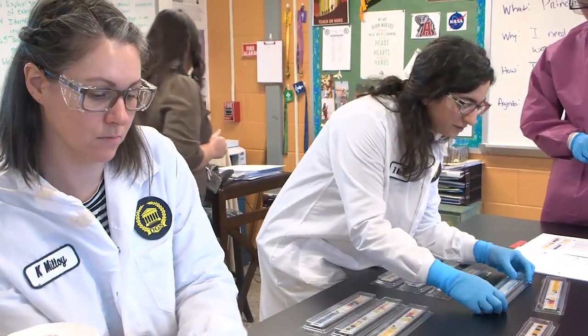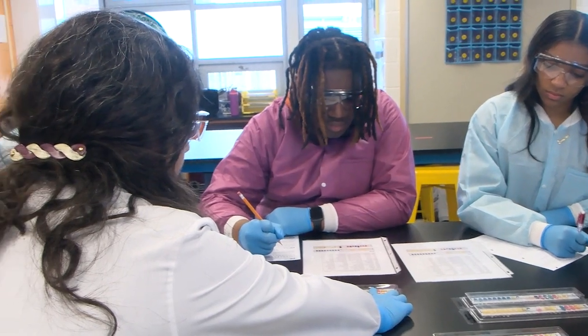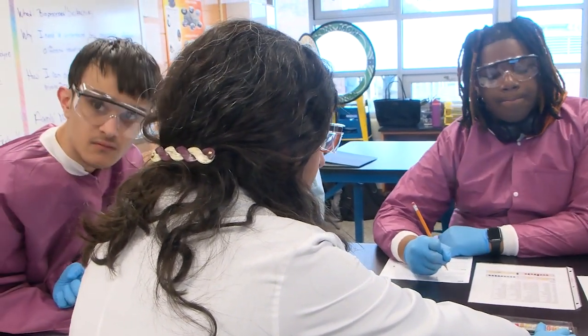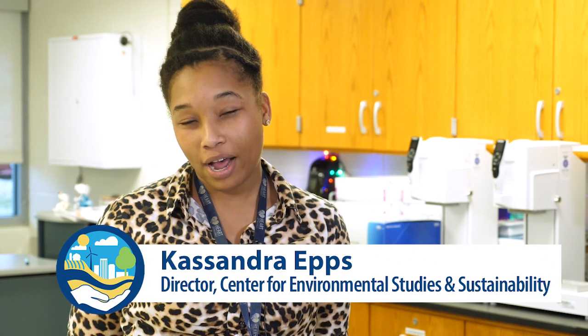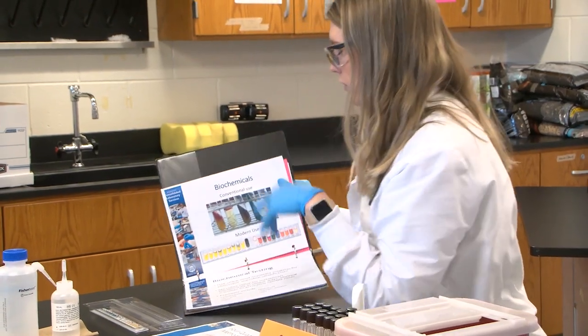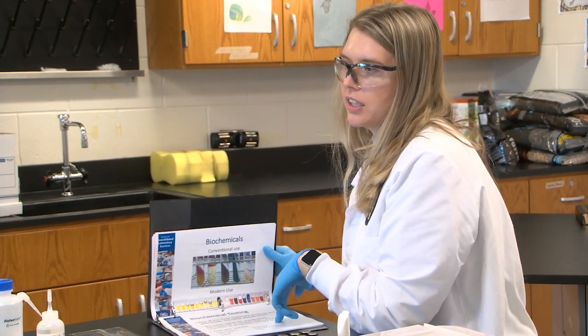The Division of Consolidated Lab Services came into our classrooms to conduct station lessons with our students. So that was pretty much an extension of what we've been covering in our unit for viruses and bacteria. And a lot of the biochemicals are sugars or amino acids that the bacteria can use as an energy.